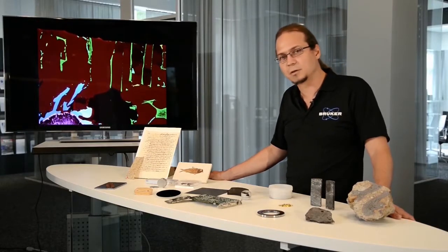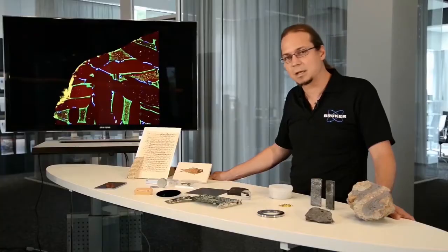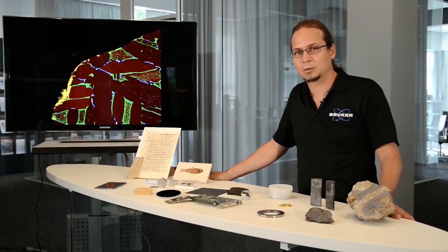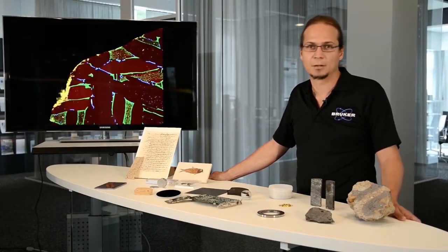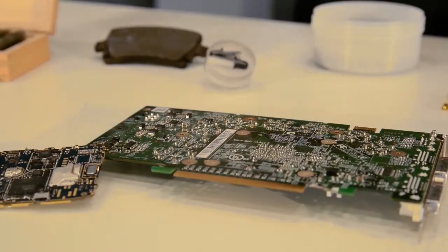And one interesting thing of the Micro-XRF is that you do not just get information of the elements in the top layers of the sample, but also from the depth. Depending on the material, you can get to micrometers or millimeters inside of your sample. This allows a unique opportunity to study not just bulk materials, but also layer and coating thickness of different materials, like in this case, the gold coating on the surface.